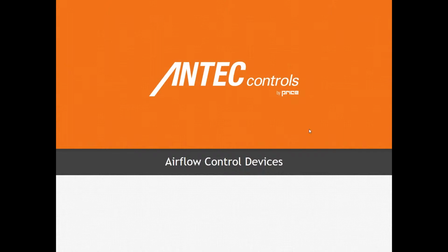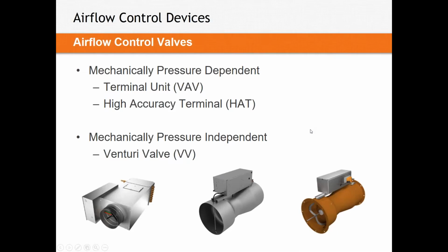So our goal here today is to cover airflow control devices, and specifically how we apply these different types of valves or dampers in the laboratory environment. Now, the reason this is a discussion point, the reason this is a presentation we'd like to give, is that there are several different technologies out there. Regardless of the manufacturer, there are several different types of these valves and dampers out there that seek to do the same job. A lot of them end up with the same end goal.